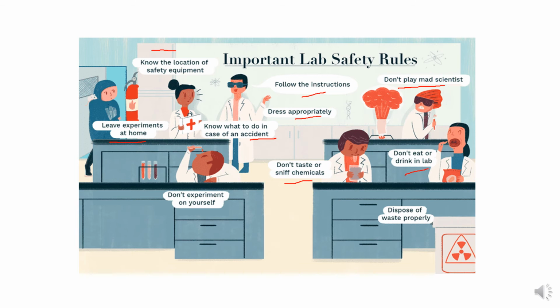This is really very important, because each chemical has different properties, of course. So first you need to understand those chemicals. And lastly, whatever you are doing, you should properly do your disposal. For example, chemical disposal is different, and if you are using papers, paper disposal is different.